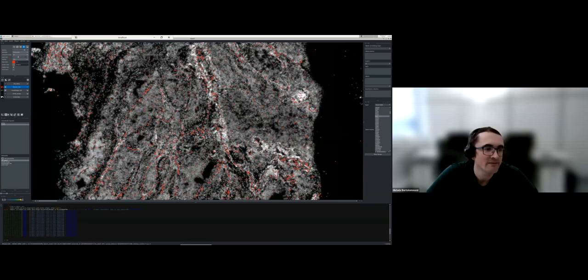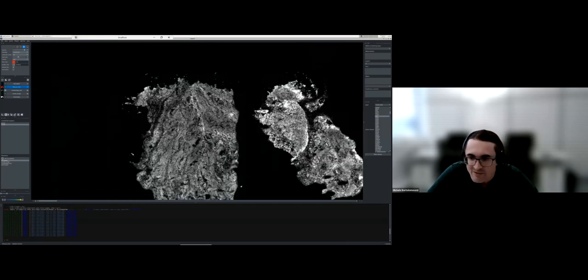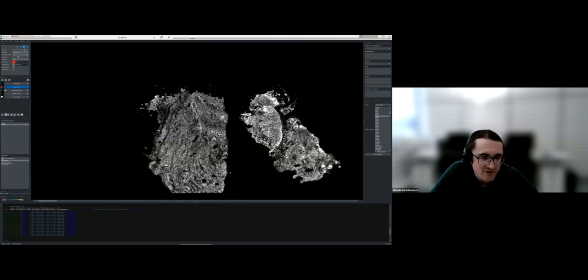At the end of this example, I also like to show you that, because this is our Xenium, but as I said, in this experiment we also worked a bit on the proteomic side.